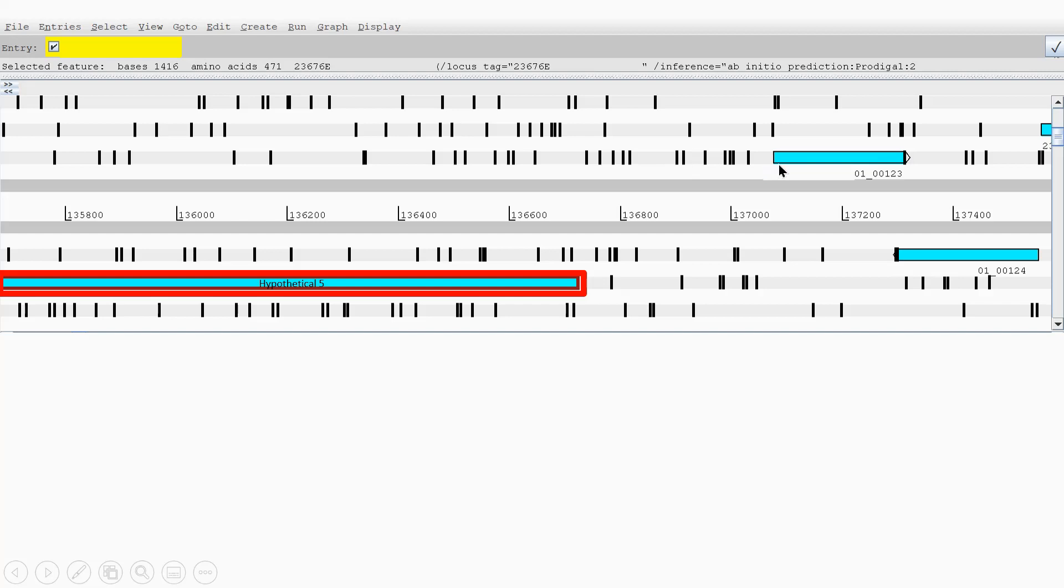Just going back, you can see here for hypothetical gene six, going this way on the plus strand. So this is the stop codon here.